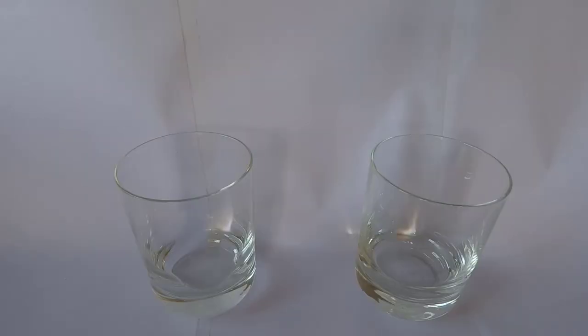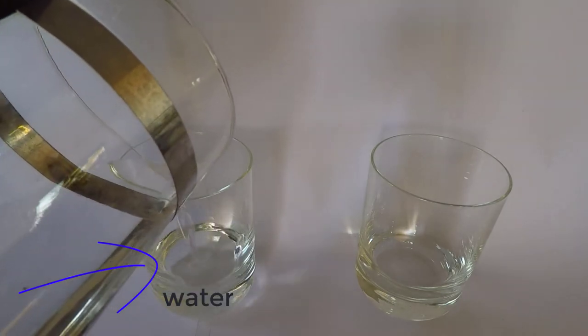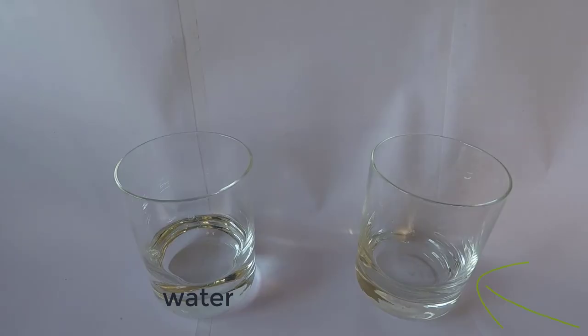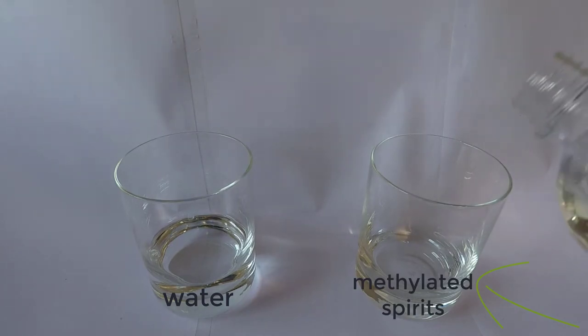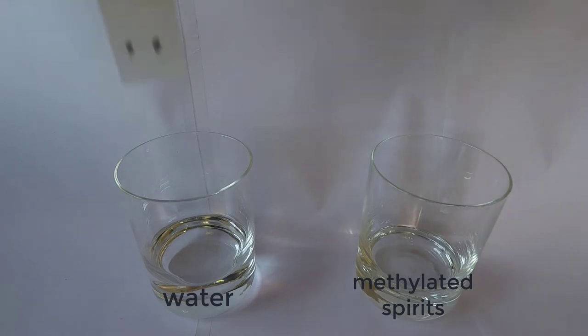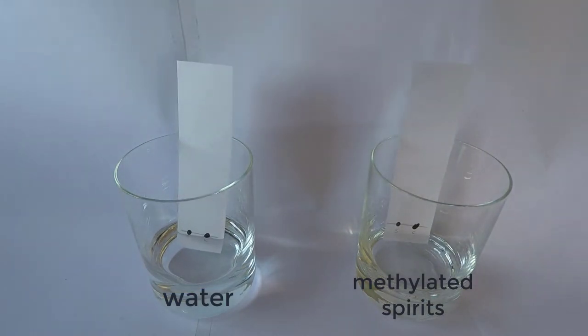Once I'd set up all the paper I wanted to use, it was time to prepare my two containers full of solution. To the left hand side container I added just plain water, while on the right hand side I added the methylated spirits. I then added my two strips of paper with my black marker, one to each solution.